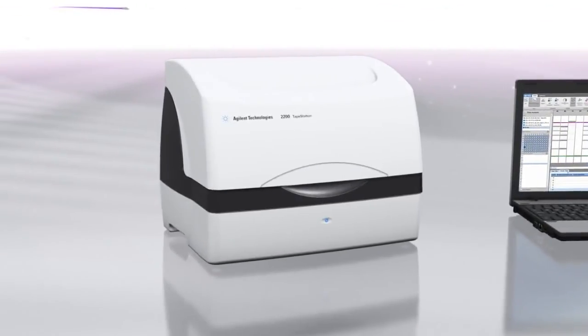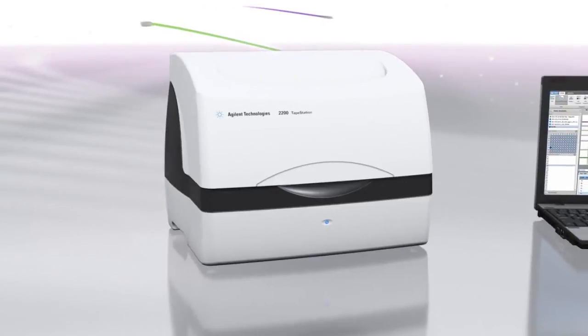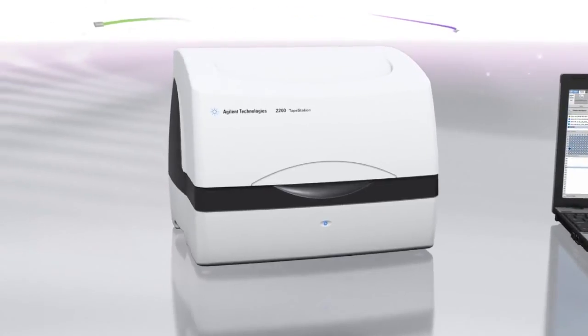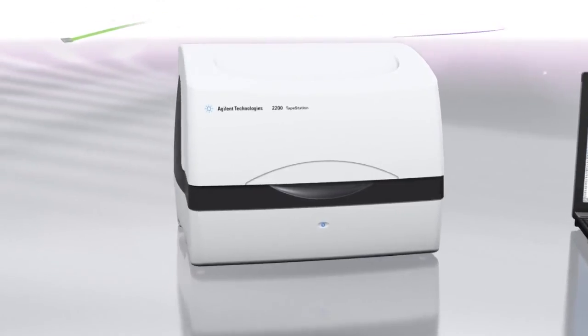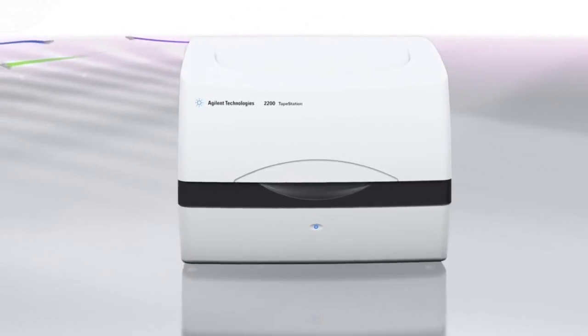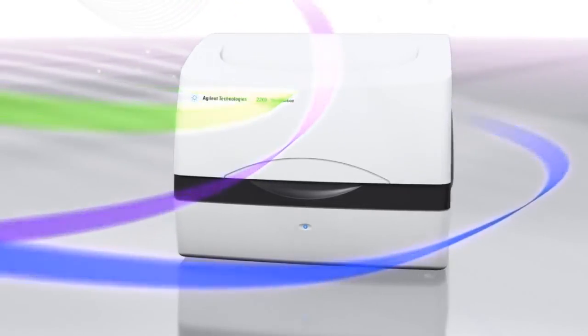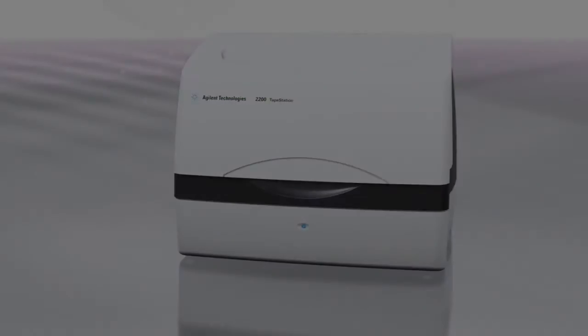Reproducible, user independent results when you need them. Benefit from the scalability, speed and simplicity of the Agilent 2200 tape station.